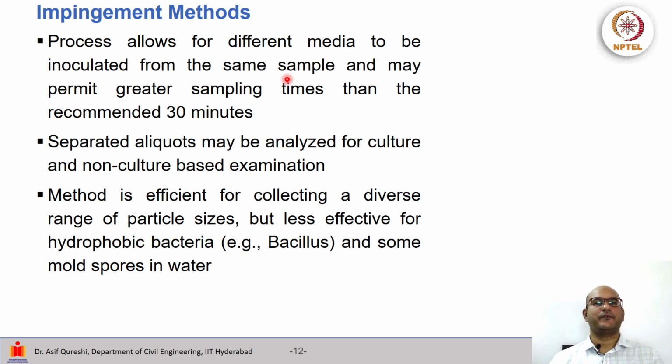The process can allow for different media to be inoculated from the same sample and may also permit greater sampling times than the 30 minutes that are generally used, but one can in principle use this method for a longer time. From the collected material, separate aliquots may be analyzed for culture and non-culture based examination. The method has been shown to be efficient for collecting a diverse range of particle sizes, but sometimes less effective for hydrophobic bacteria such as Bacillus and some mold spores in water.